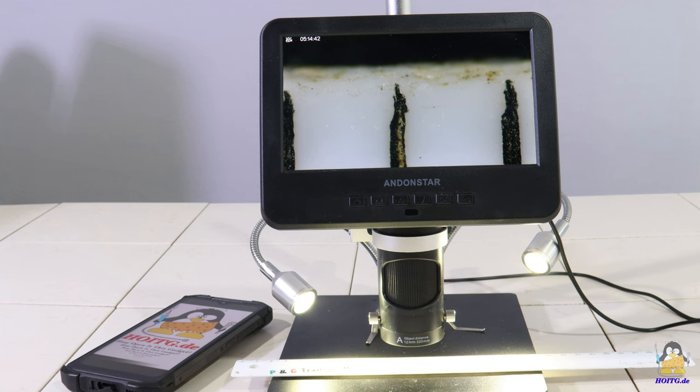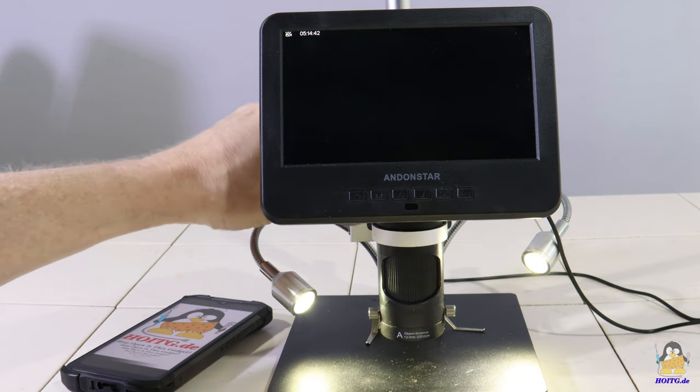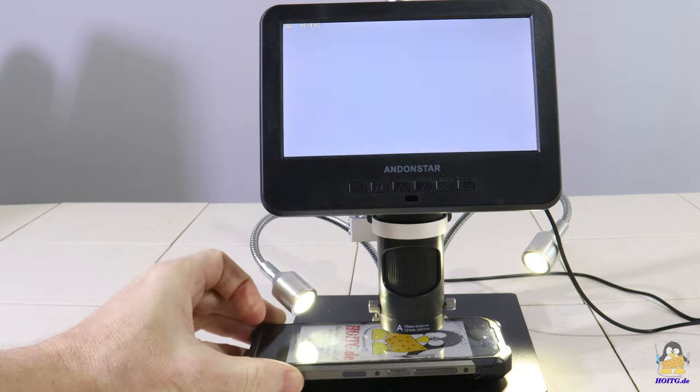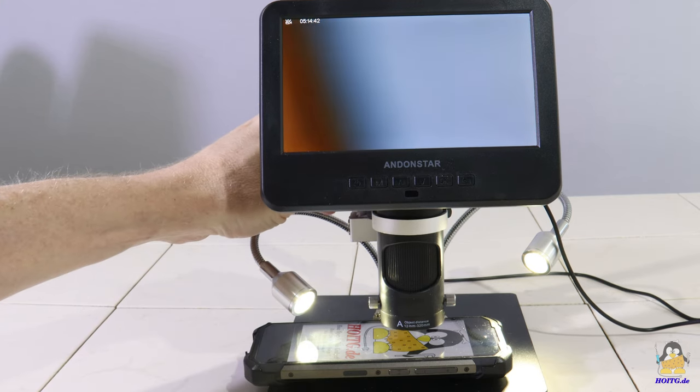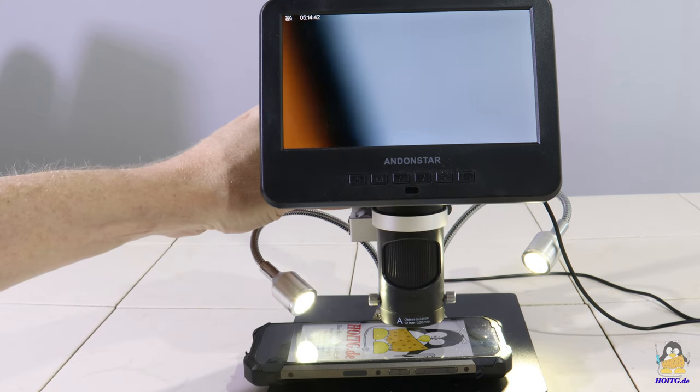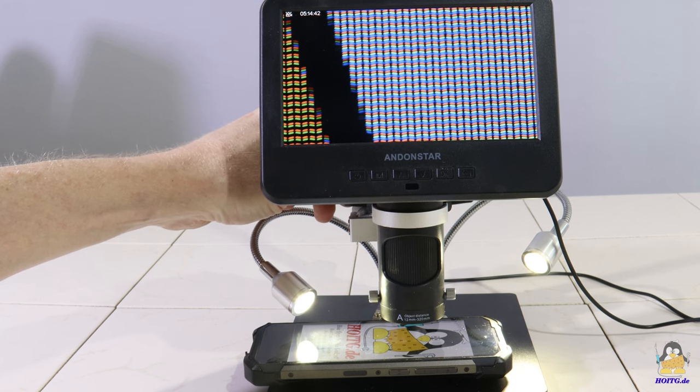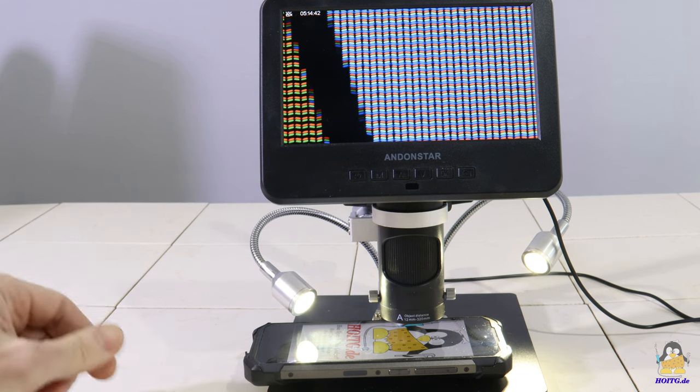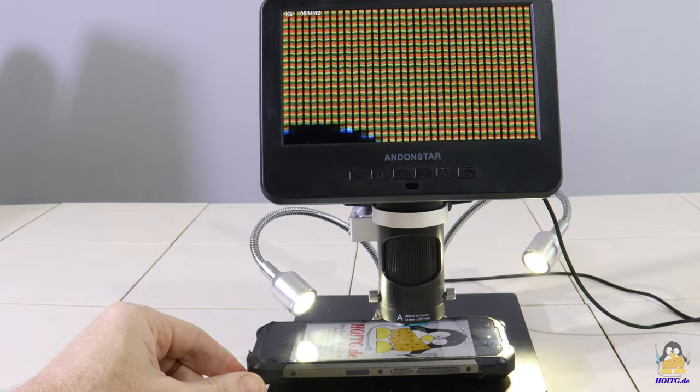Since the millimeter scale of the ruler is gigantic for a microscope, an everyday object is used as the next reference grid, a smartphone screen. The display is composed of a regular grid of colored dots. The approximately 2.2mm correspond to 36 pixels on the smartphone screen.